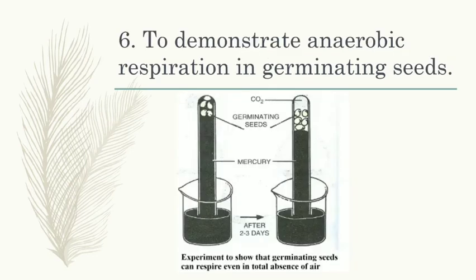Now the next experiment is to demonstrate anaerobic respiration in germinating seeds. So children, you know that anaerobic respiration means the respiration in which oxygen is not involved, taking place in the absence of oxygen. So here we are showing that germinating seeds can respire even in the total absence of air. अगर air की availability नहीं है तब भी germinating seeds जो हैं वो respiration को show कर रहे हैं. So that is the anaerobic respiration.